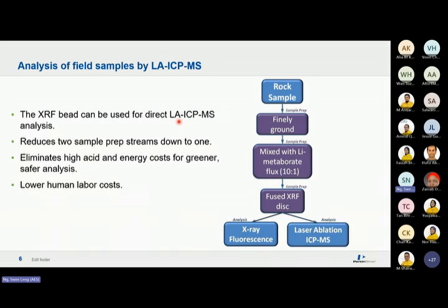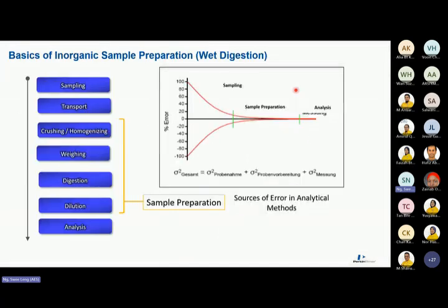you make a glass bead and homogenize your sample. In terms of geology, even the rock itself, because I'm not a geologist, the rock has a lot of names and different types. So when they make it into a glass bead, they homogenize any type of rock, different types of rock, so they all become the same background. All right, so that is an overview of the sample type.